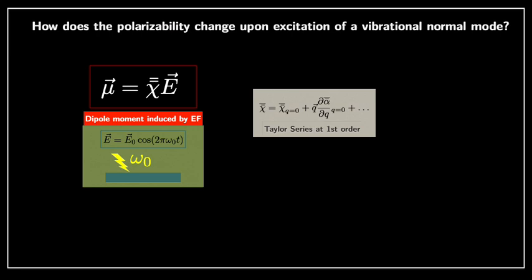So again, all you need to know here is some simple differential equations and maybe tensor algebra, but very little, really. All you really need to realize is to use a Taylor series. So what's in the gray box is basically telling you how the dielectric tensor has changed once we have a vibration in the material.